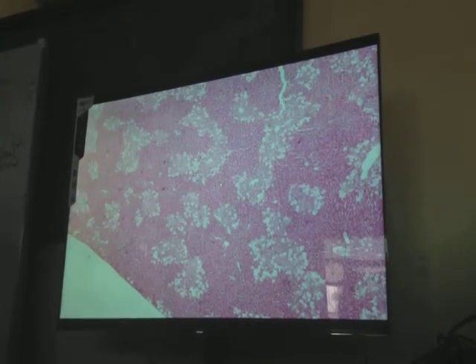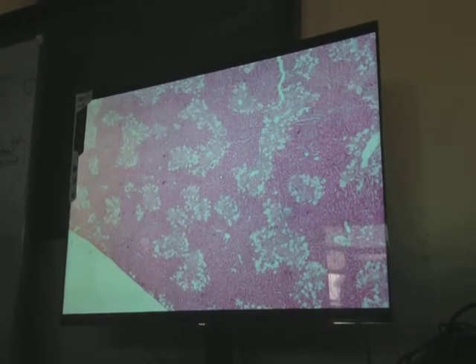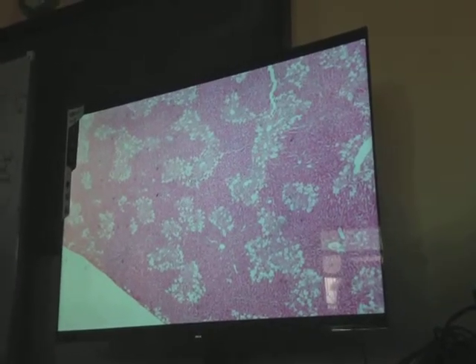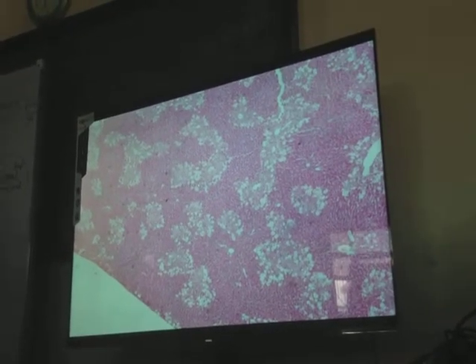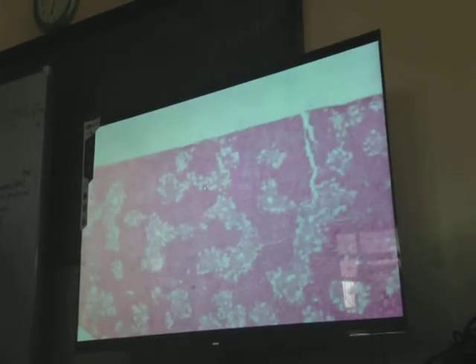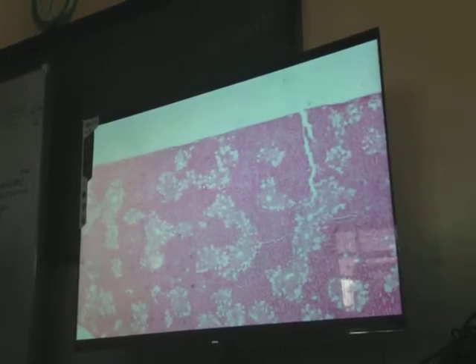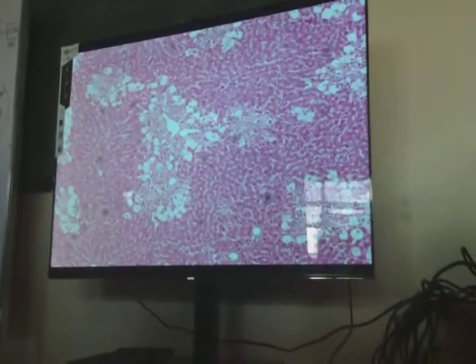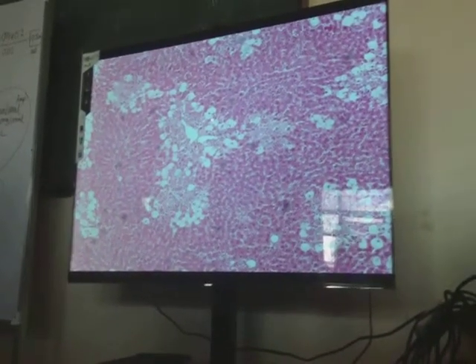You have seen this abnormality already in the prelims. What is your diagnosis? Okay, carbon tetrachloride poisoning. So the characteristic abnormality is the bloating of the affected hepatocytes.